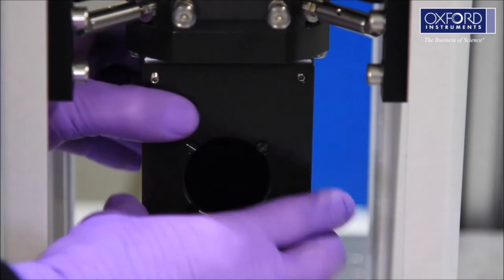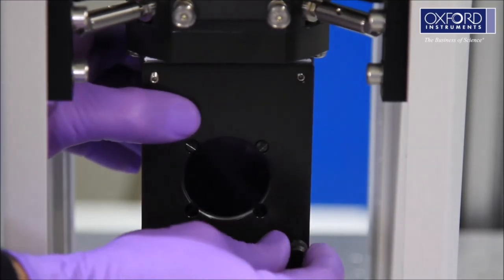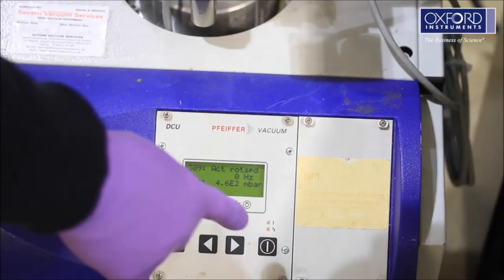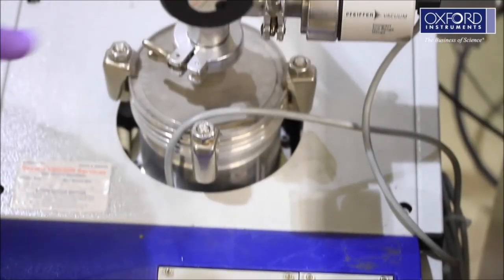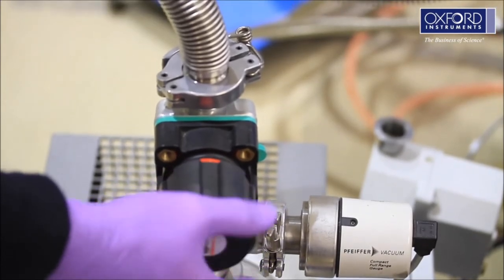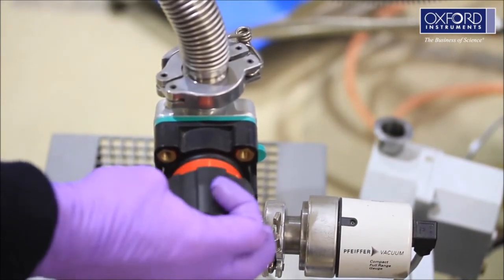Refit the sample access plate. Immediately turn on the vacuum pump. Pump the cryostat for a minimum of two hours. You should achieve a pressure below 10 to the minus 4 millibar.